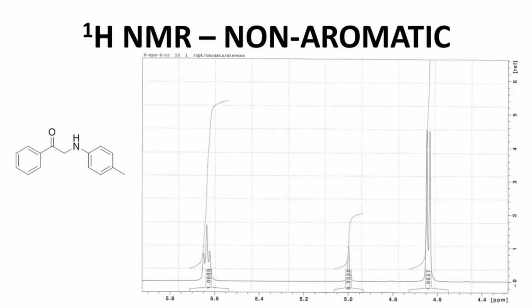All right, so let's move a little bit more upfield. We're now around the 5 ppm range for this NMR spectrum, and we have 2 signals that show up in this range. We have these hydrogens that are off that CH2, and then we also have the NH. Now, I find this part of the spectrum kind of interesting. Typically in NMR, people often ignore OHs and NHs in terms of looking at neighbors and coupling. But we are performing this NMR spectrum in DMSO. In DMSO, NHs and OHs do count as neighbors.